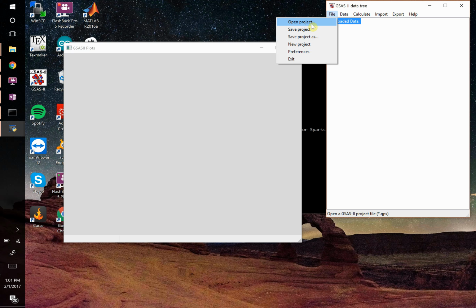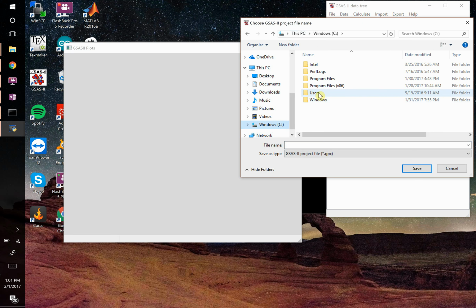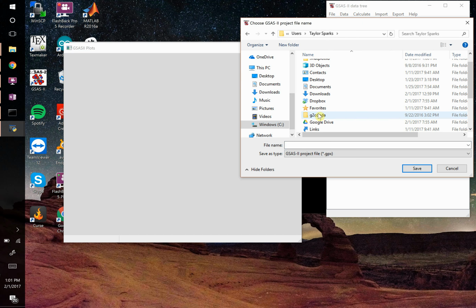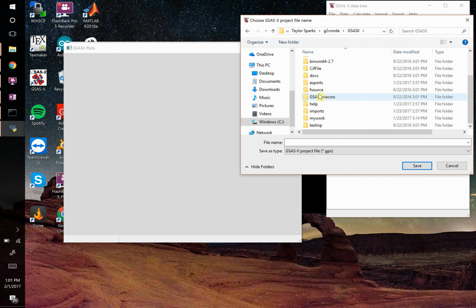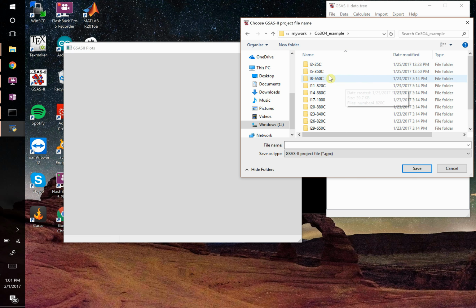So let's open a new project, or just do a save project as, and save this where we're working. I've got mine in my users, G2 Conda, that's what it's built out of, GSAS-II, my work, and let's do a new one. We'll call it in-class example. Well, we'll just go to the one that's already here. So I'm going to put it in the 25 degrees Celsius.